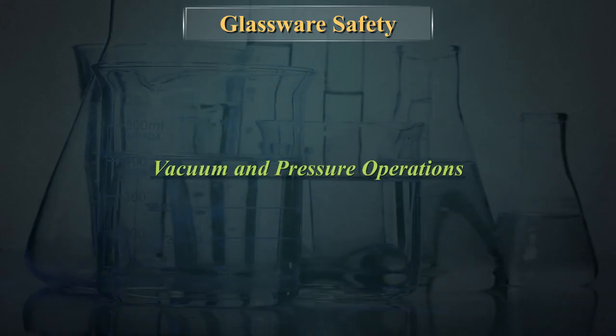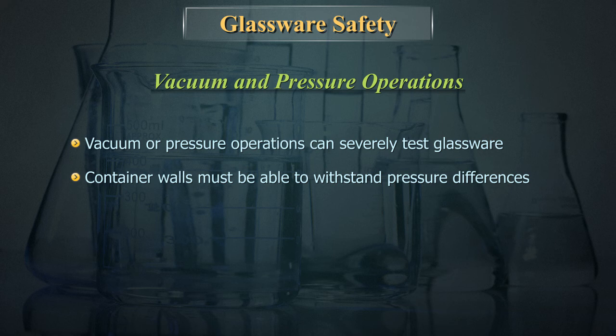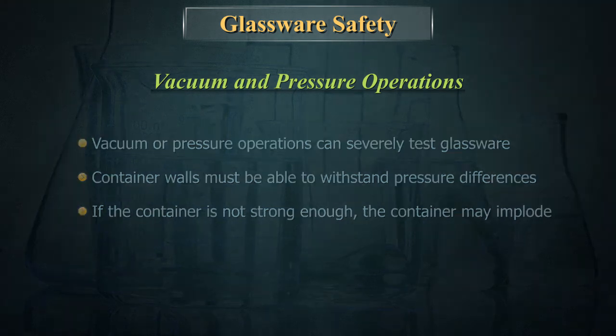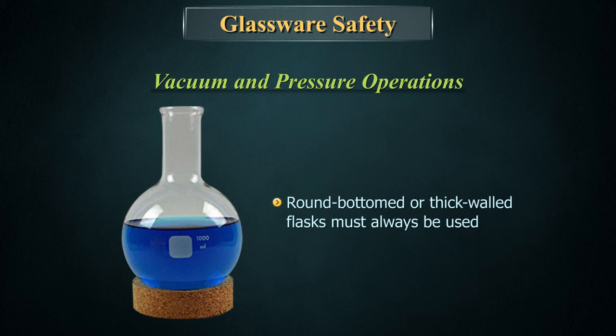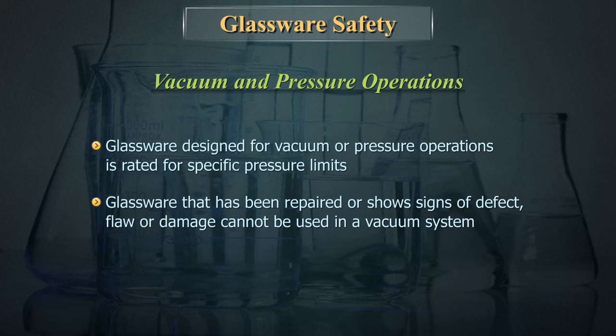Vacuum or pressure operations can severely test glassware. Container walls must be able to withstand pressure differences. If the container is not strong enough, it may implode. Round-bottomed or thick-walled flasks must always be used. Glassware designed for vacuum or pressure operations is rated for specific pressure limits. Glassware that has been repaired or shows signs of defect, flaw, or damage cannot be used in a vacuum system.